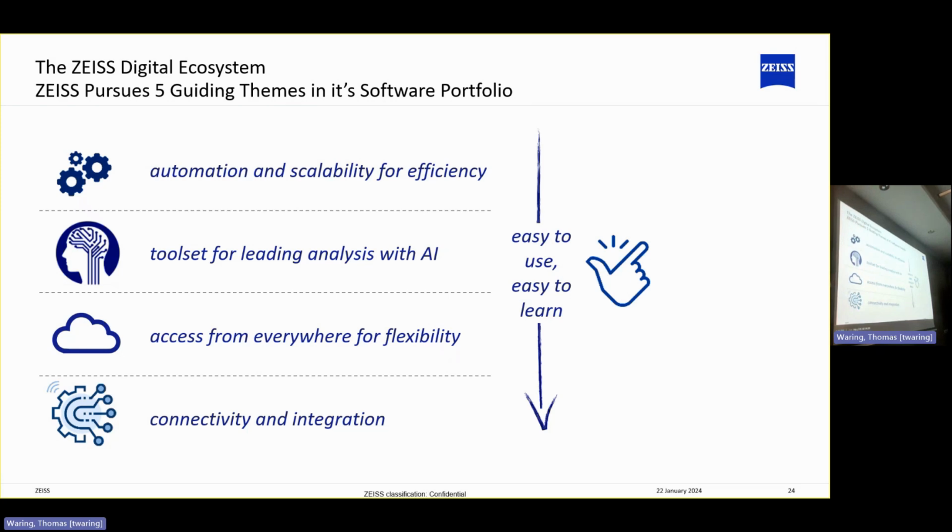The idea with the cloud is that you can access the data from anywhere. You don't have to be on the local systems. We can share and collaborate very easily. And yeah, the whole thing, we try to make as easy to learn as possible. And if it's not, it's part of my job to make sure that you can know how it's working.